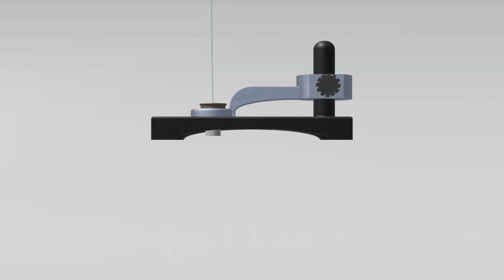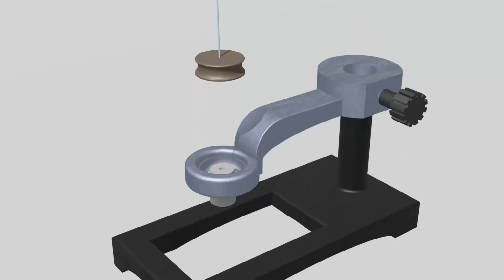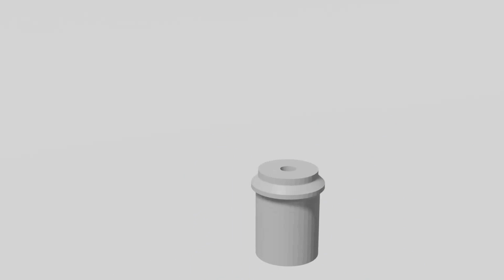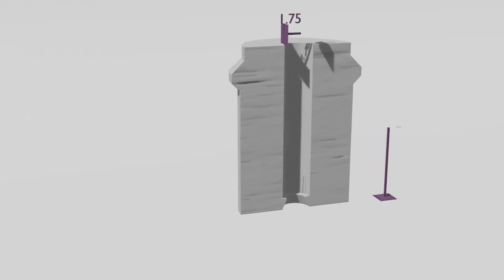We have designed a device that is able to produce a free-floating monolayer and quantify its deformation both radially and from a side view using an applied force using phosphate buffered saline, or PBS. To accomplish this, we use a 1 centimeter tall tube of condensed polystyrene, a material which is known for its biocompatibility and hydrophobicity. We then mill a 1.75 millimeter hole through the tube, which is where our applied force will take place.